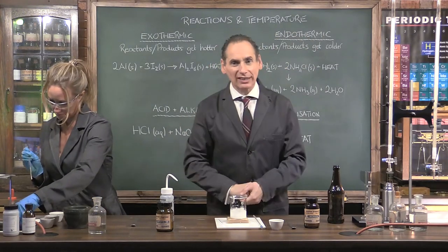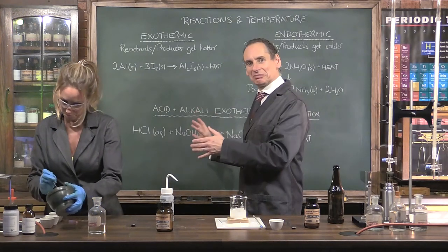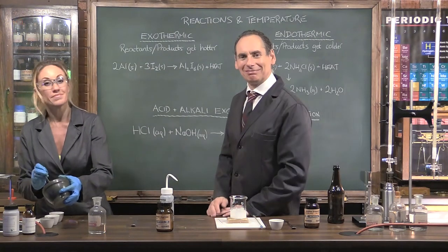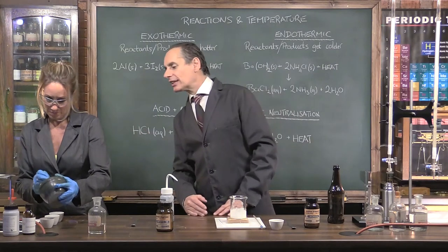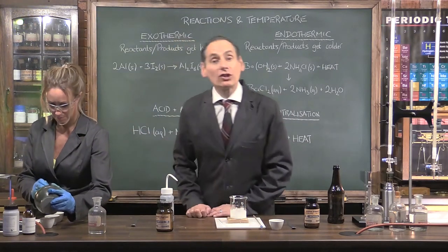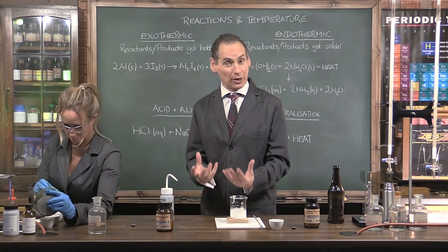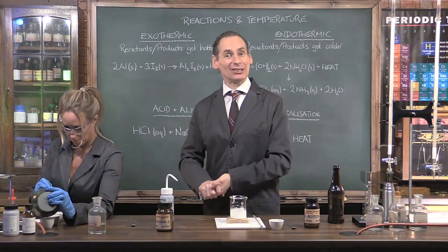We're not going to do that in here though. We're going to take our cameras outside because it's an outside broadcast. But right now what Emma's doing is getting the powders and putting them in individual crucibles. We're not going to mix them in here because the reaction can spontaneously start.